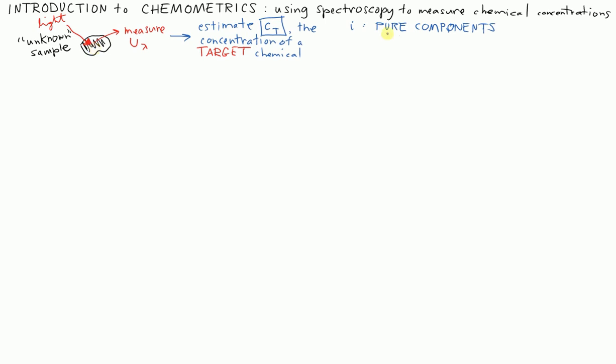So the actual sample, if I were to break it down biochemically, I could list a certain number of pure components, and if I mixed those together in the right ratios, I would recover the chemical concentration of the thing that I interrogated with my light. That's what I'm indexing over here. How many actual distinct chemicals are there in this tissue?